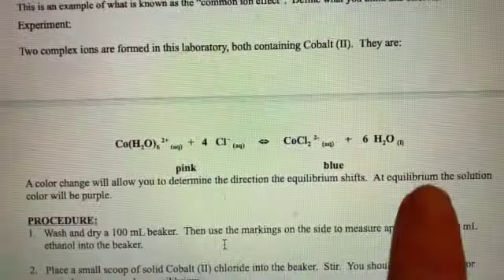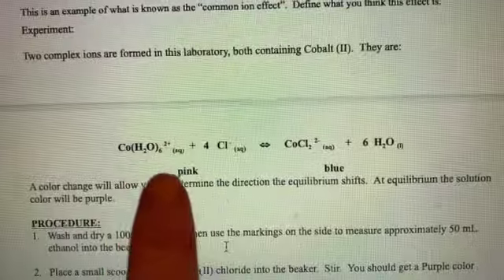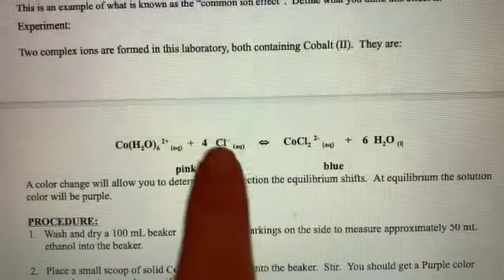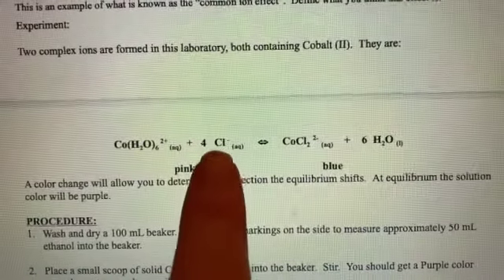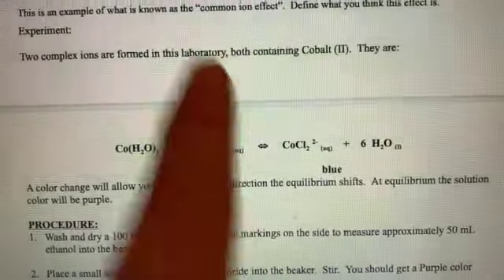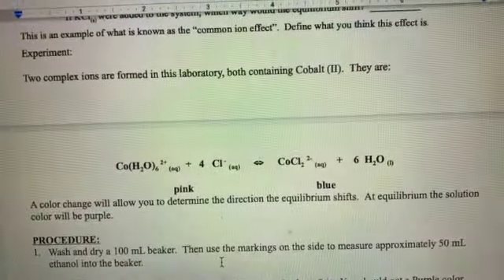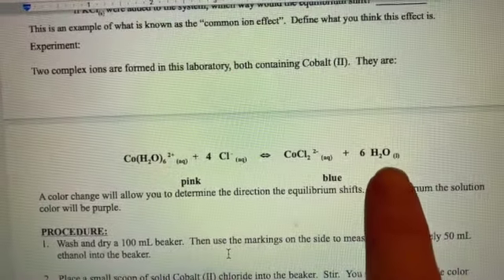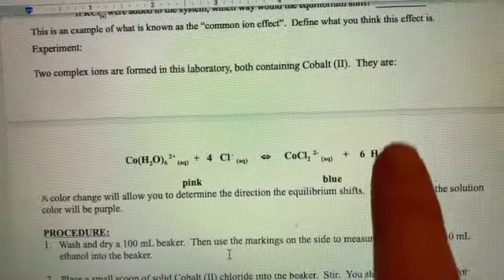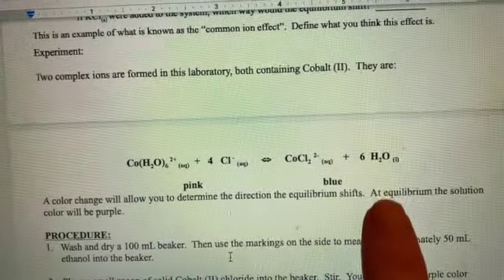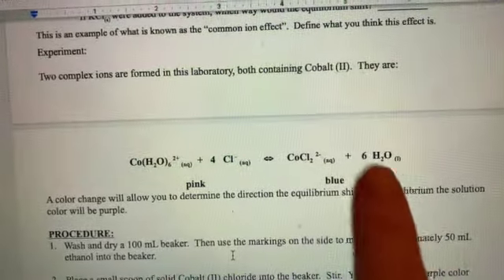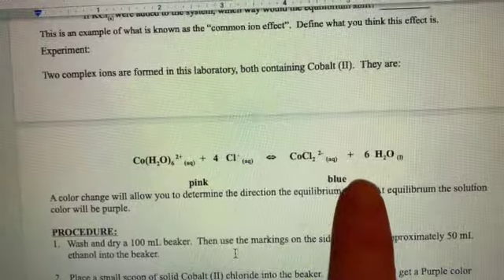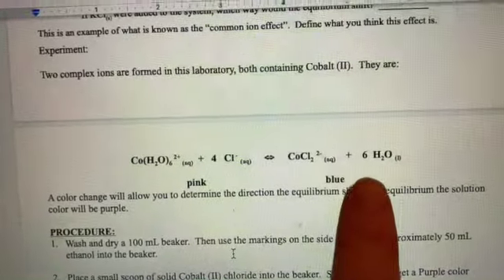You're then going to see Maurice add some calcium chloride, which is going to increase the concentration of Cl⁻ minus, and you want to see what happens to that reaction. You'll then see Maurice add some water, and with that it's going to increase the amount of water — let's see how the reaction responds.